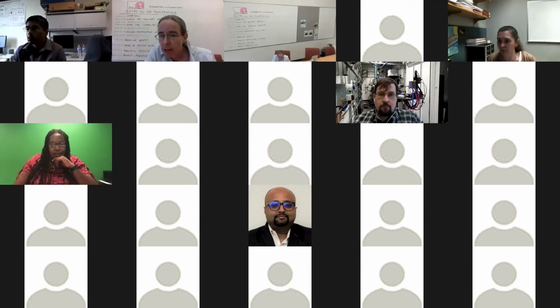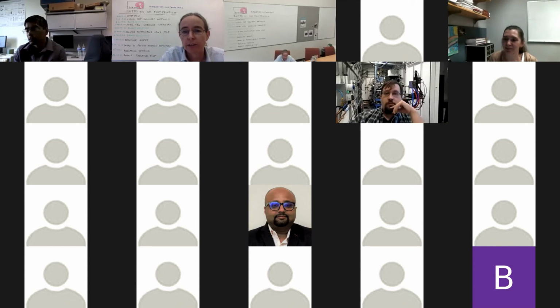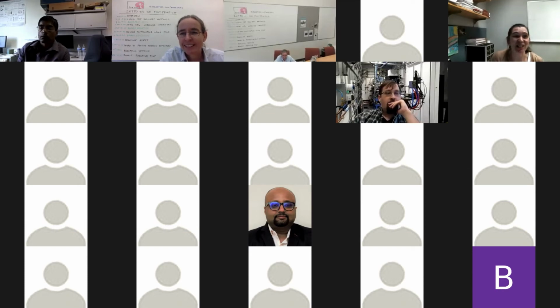A couple of questions about CF3 for Jonna. Can we conclude the CF3 reagent acts as a radical scavenger, a radical quencher? In that case, do we not need to do our usual quenching after the experiment? Yes, CF3 reagents actually act as a scavenger, and we did some studies with different attenuation.